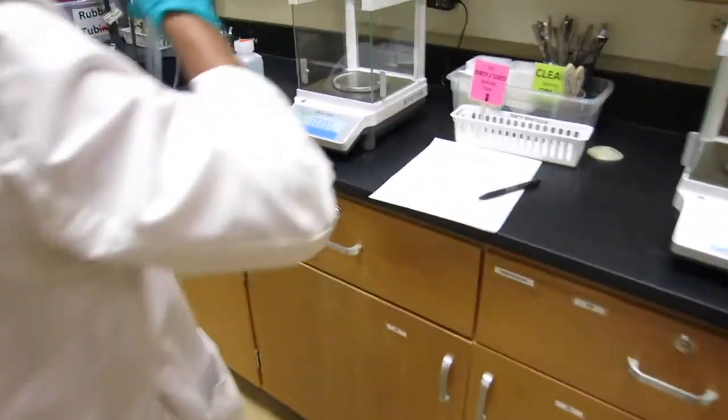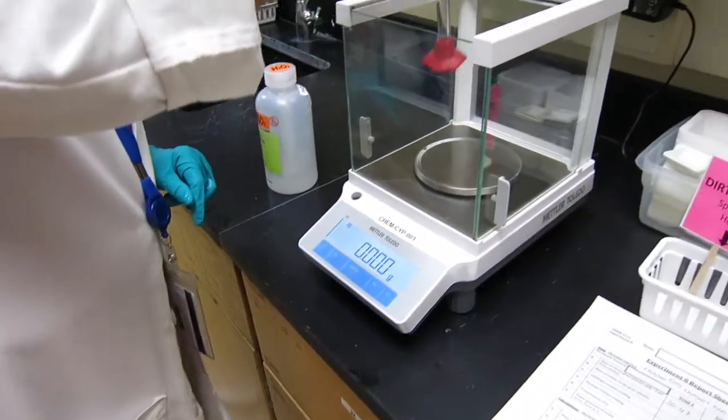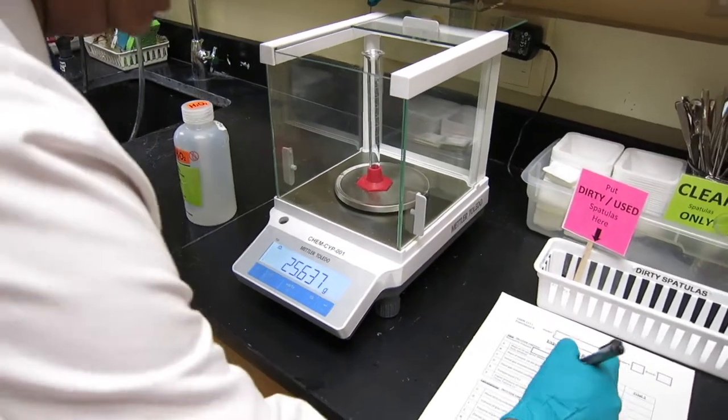Now we have to weigh the empty, zero, make a zero this one. We tare it again, and measure the empty graduated cylinder.